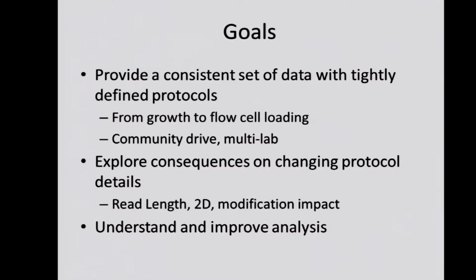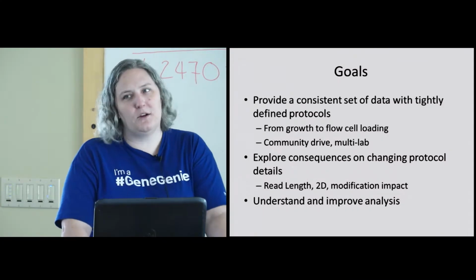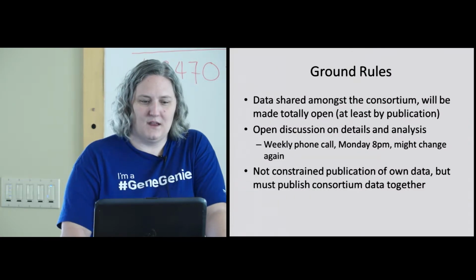From growth to flow cell loading, this is community driven, multi-lab. Multiple optimizations are being experimented on right now. We want to explore the consequences of changing the protocol and improve data analysis. So if you're an analysis person, you want to play with nanopore data, give me a call. We definitely are interested in speaking to you.